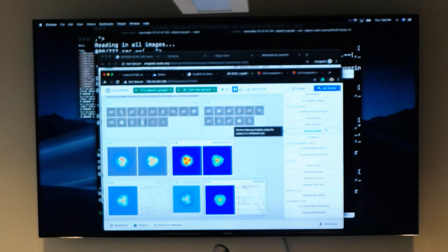So the main thing to note is if you're doing a ResLog plot, you will have to take into account your attrition. If I had a certain number of particles, I cleaned away 80% of it, and this is what I'm doing a ResLog plot of, then don't forget that if I collect of like kind, I will have some attrition. So you may have to collect more particles than just that plot.